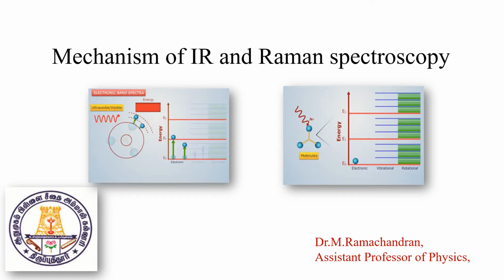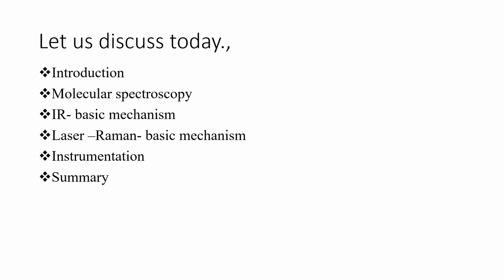Okay, so in what way has that type of spectrum been analyzed by using these studies? We can discuss in detail. Today we will discuss the introduction and molecular spectroscopy, followed by the IR basic mechanism, the laser Raman basic mechanism, and what type of instrumentation has been developed using this particular mechanism, and finally a summary of today's ideas.